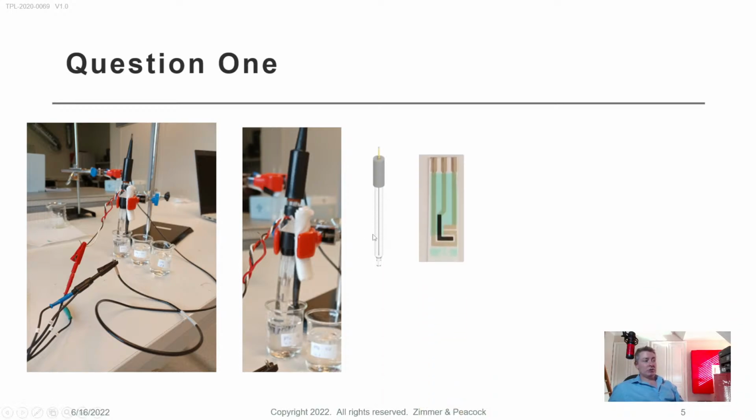We've got the true reference electrode, which is one of these glass barrels full of saturated, probably potassium chloride, and we've got a silver chloride wire in the middle. So it's a true silver chloride, and then we've got one of our SPEs. We've got them in wet contact with each other, and we're just measuring the voltage between the two electrodes.